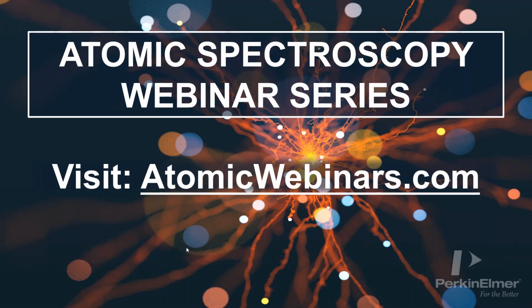And then I think a comment here is, well, with the shelf life of cells and the measurement possibilities, also fixing the cells could be helpful sometimes. Okay, yeah. That's a good point. Yes, I do know researchers doing that, because, as you mentioned here, cells do have a shelf life. Many of them do, and for measurement possibilities, you can fix the cells, so stop them from rupturing, not being viable anymore. Good point.